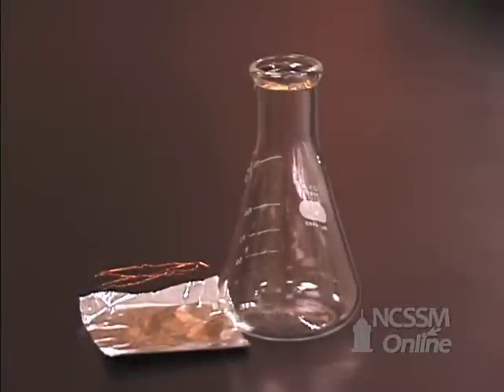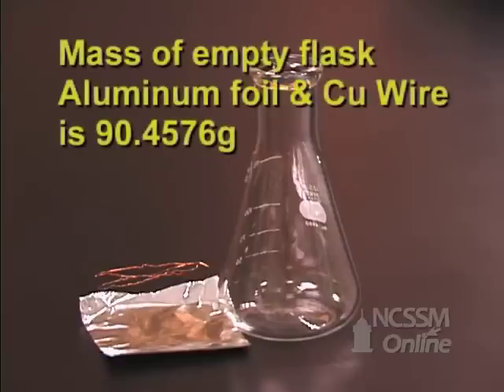In the Dumas method of determining the molar mass of a volatile liquid, we will start out massing an empty 125 milliliter Erlenmeyer flask, a small piece of aluminum foil, and a small piece of copper wire.